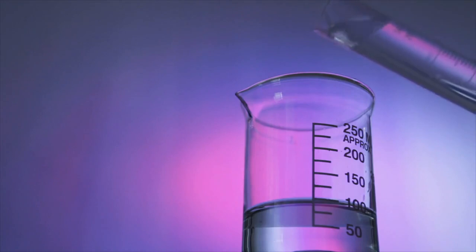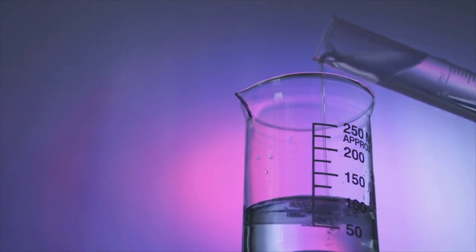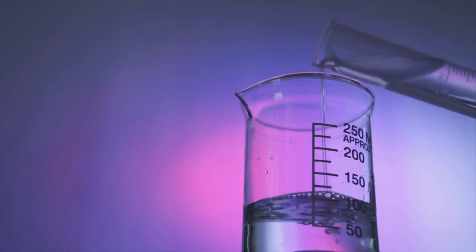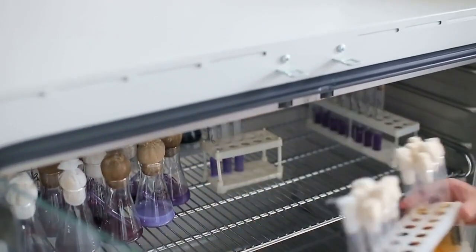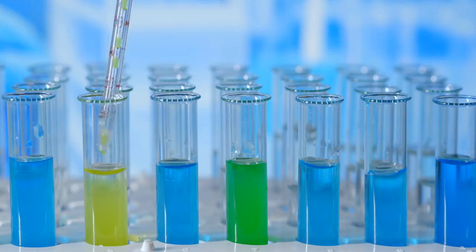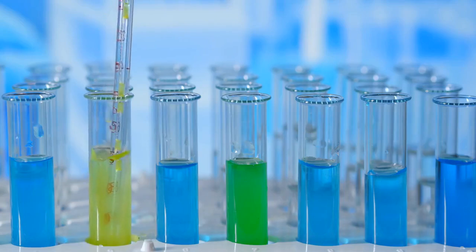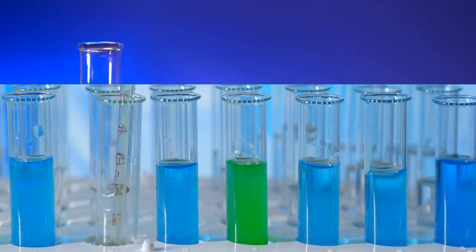Beaker. A cylindrical container with a flat bottom and a pouring lip used for holding, mixing, and heating liquids. Test tube. A small, cylindrical glass or plastic tube used for holding and heating small amounts of substances.